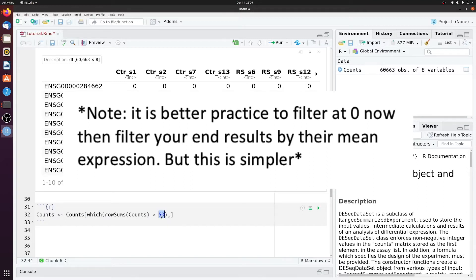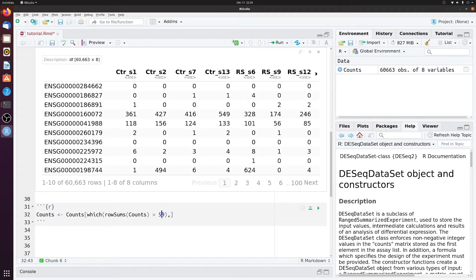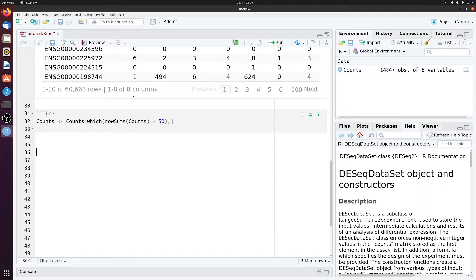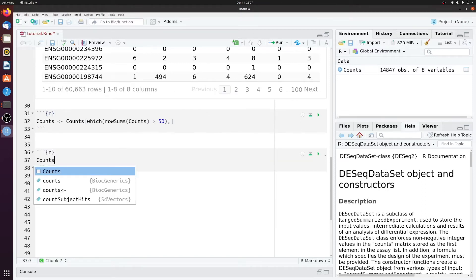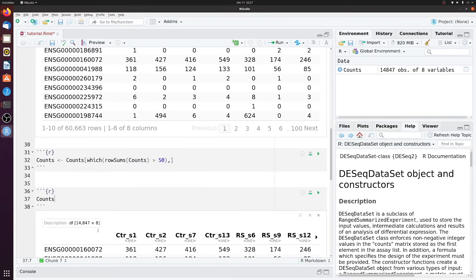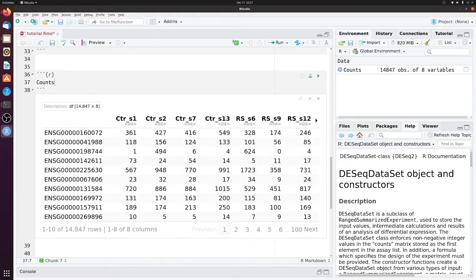So counts, which the row sums of counts is greater than 50. So again, 50 is just kind of an arbitrary number I'm picking here. If, for example, you're more interested in a really low abundant gene, maybe you would look at even lower than 50, or this threshold is something that you need to play around with. You at least should get rid of everything that is zero. So if we run this, we'll now see counts.